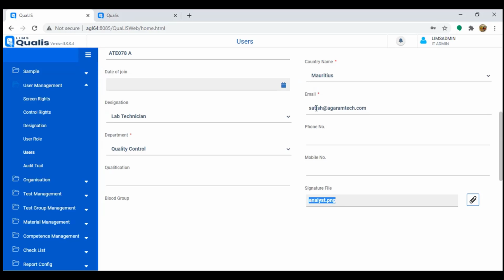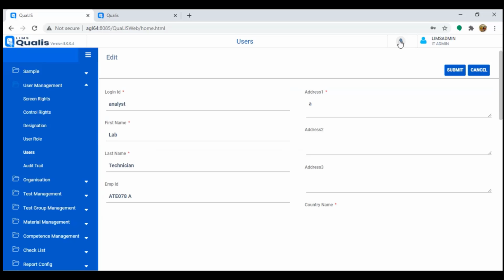Of course, there is also email. We may use it for sending the alerts. As I said, the alerts are displayed here. They can also be sent by email, so people won't miss them even if they don't log into the LIMS. That is the purpose, right?